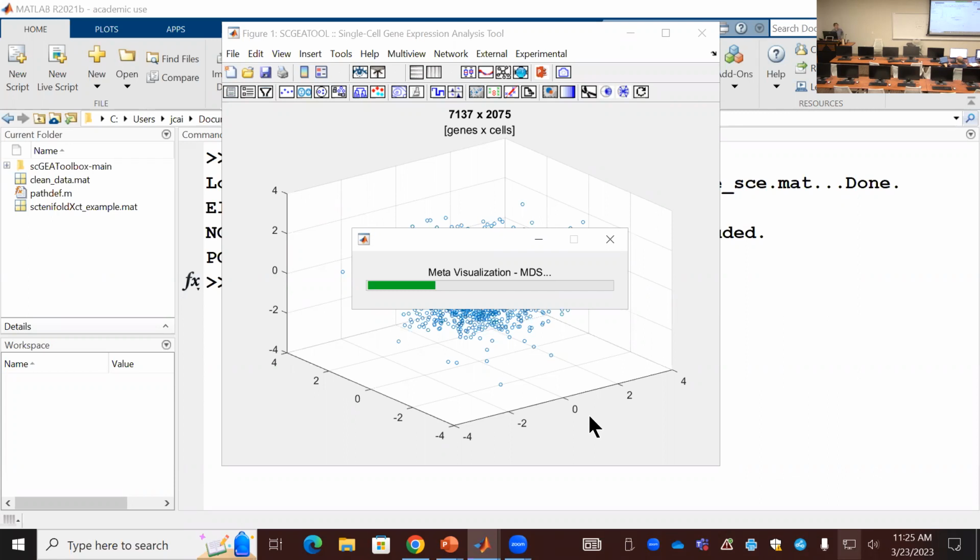I encourage you to use it and see whether it gives you better results. It will run t-SNE, and not only one time, but also using different parameters for t-SNE and different parameters in UMAP. And t-SNE and UMAP results will be highly sensitive to the selection of these parameters.